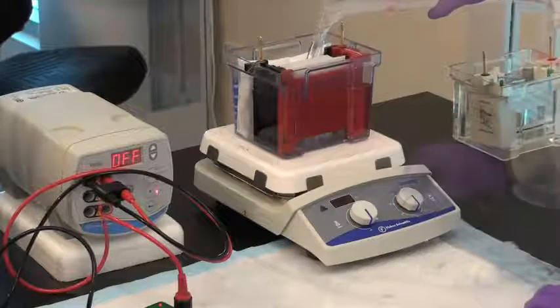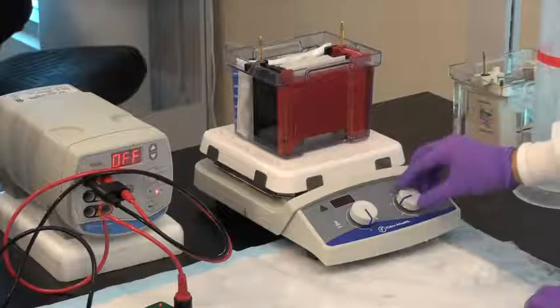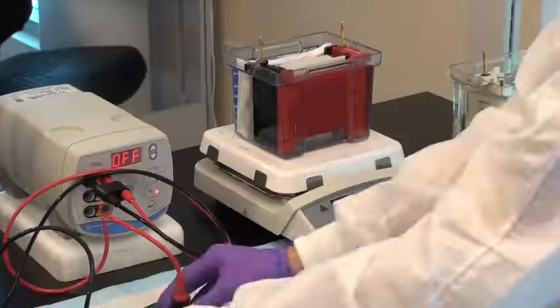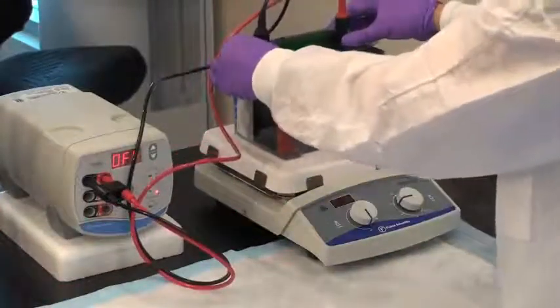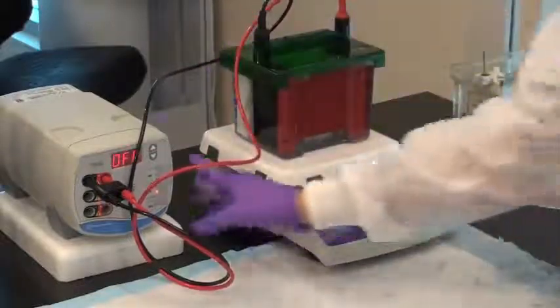Place the tank on a stir plate and set the stir feature to a low setting to circulate the buffer and keep it evenly cool throughout the transfer. Secure the top of the tank and turn on the power supply. The transfer should take about 1 to 2 hours.